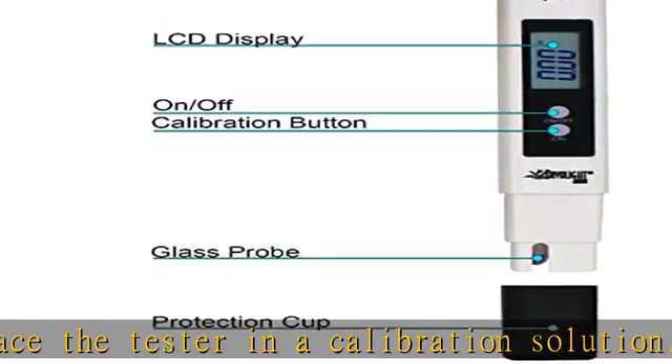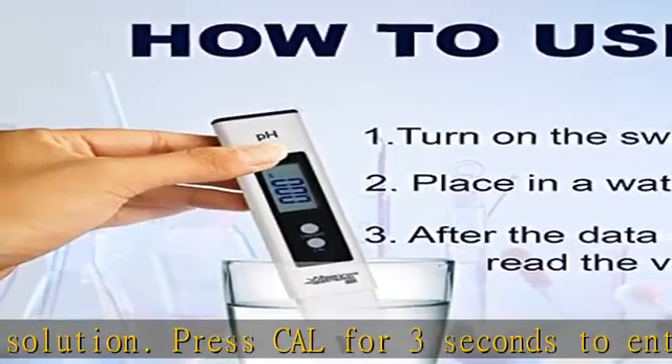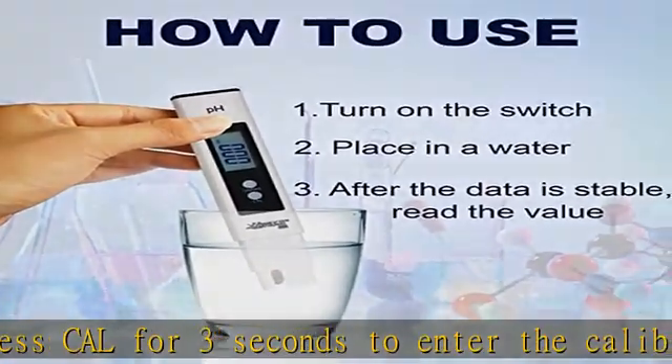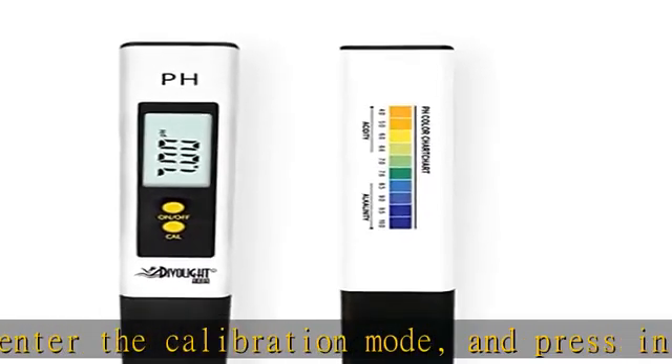Automatic temperature compensation (ATC): there is no need to worry about the temperature of the liquid being measured, as the pH meter has an automatic temperature compensation function. The mini size of the pH meter allows you to easily put it in your pocket and take measurements anytime, anywhere.